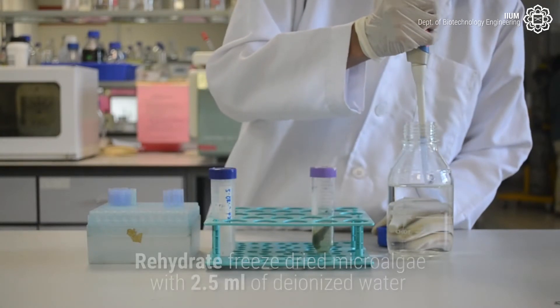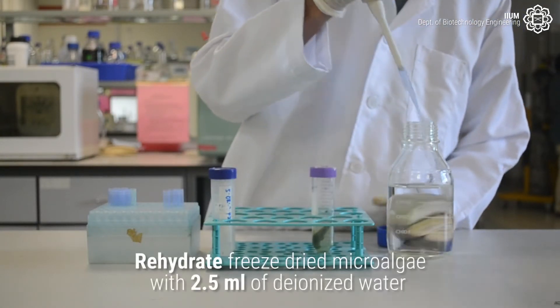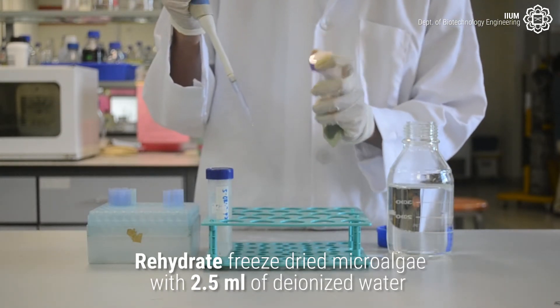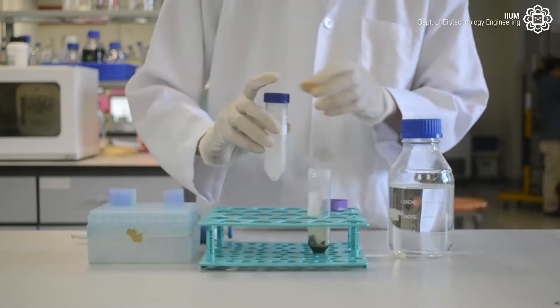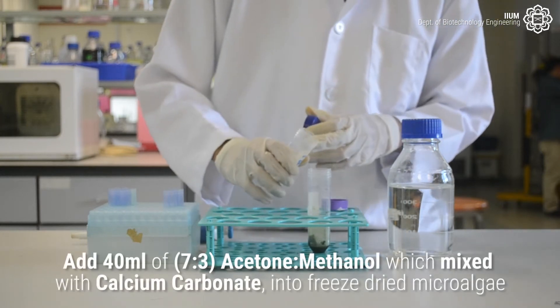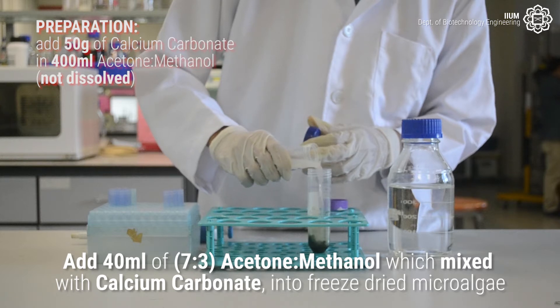Firstly, weigh the freeze-dried microalgae. Then rehydrate the freeze-dried microalgae with 2.5 ml of Deionized Water. Add 40 ml of Acetone Methanol mixed with calcium carbonate into the freeze-dried microalgae.